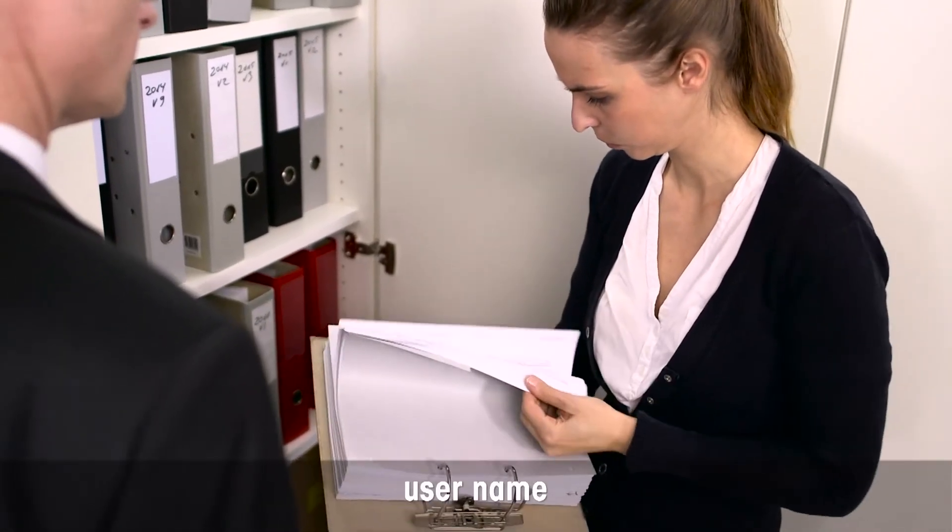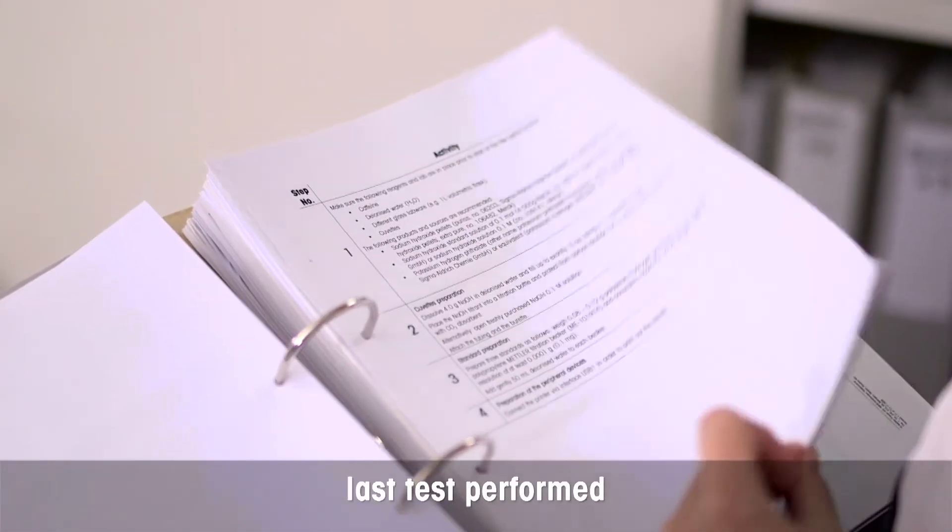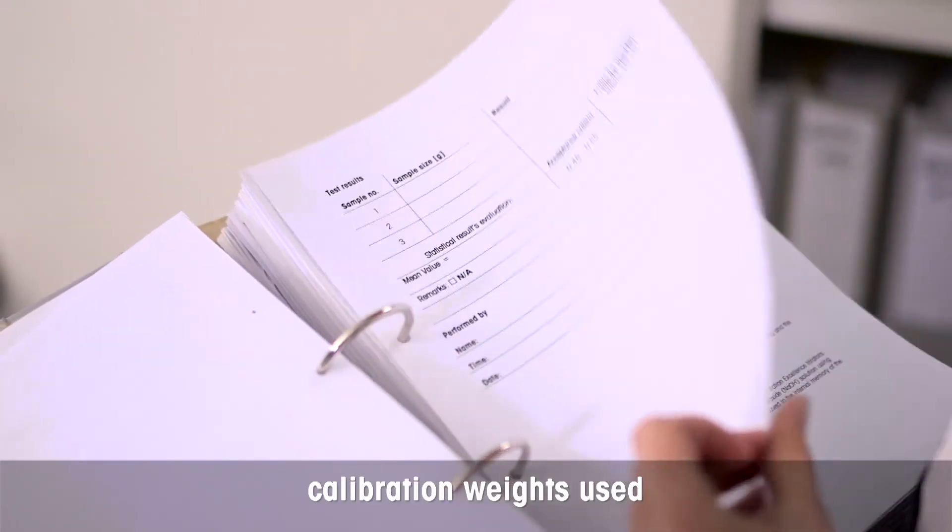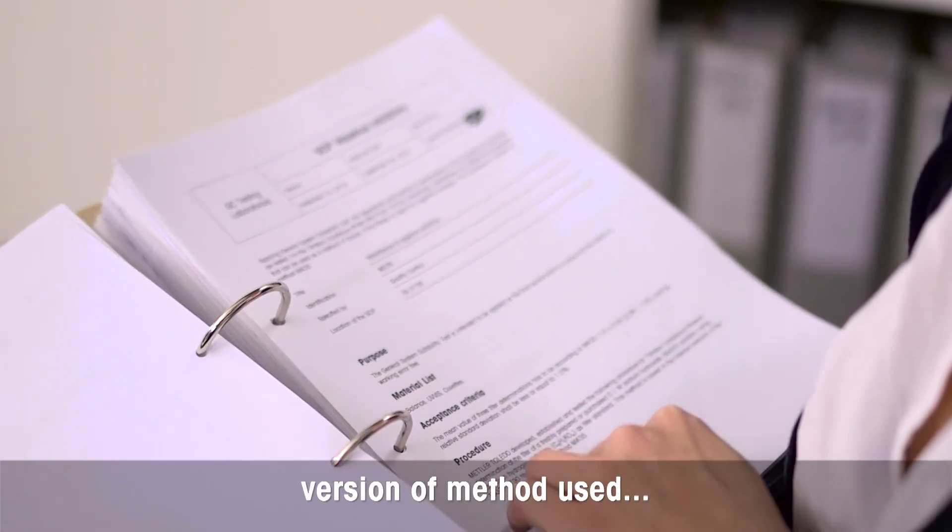User name, instrument ID, instrument status, last test performed, calibration weights used, time and date, version of method used.